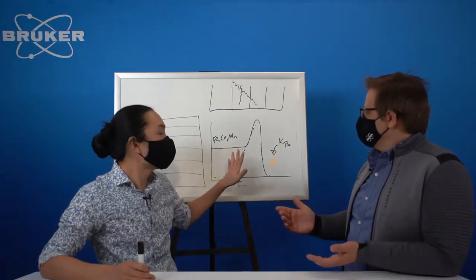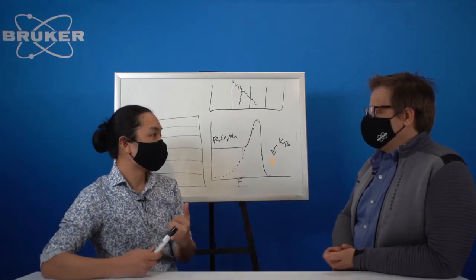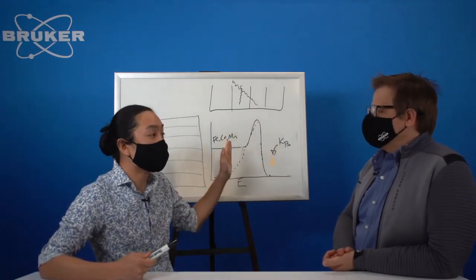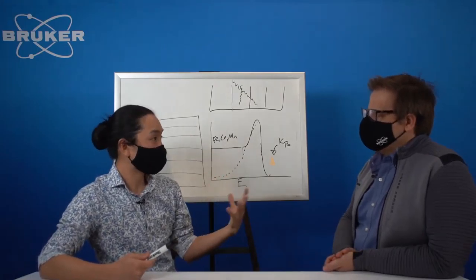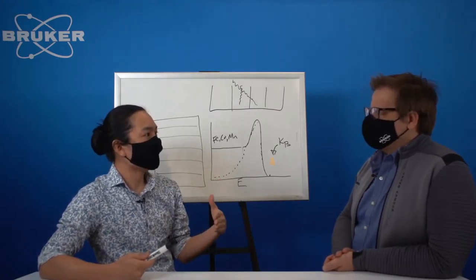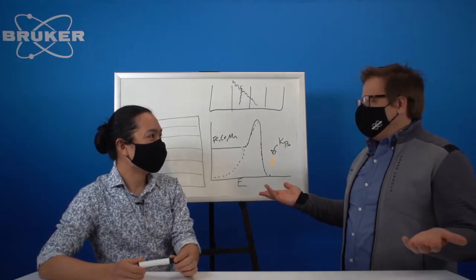So historically, those really, really old systems that were really, really slow, you had a lot of stuff in the way of the X-ray. You had nickel filters, and we'll show you that whenever we get down to the lab in a little bit. But that would get rid of your K-beta. You would have things like secondary monochromators, which again is a physical thing that you're putting in the way of your detector, right? It's like having a really thick pair of sunglasses and then trying to walk around in a dark room looking for a very small amount of signal in your sample. You go to all the trouble to make the X-rays and you're throwing them away.